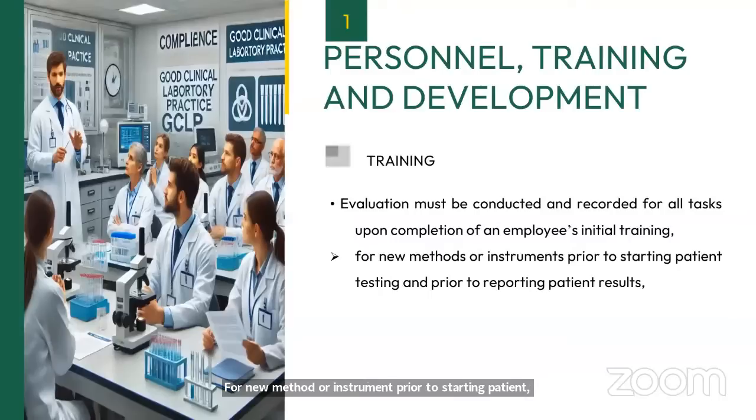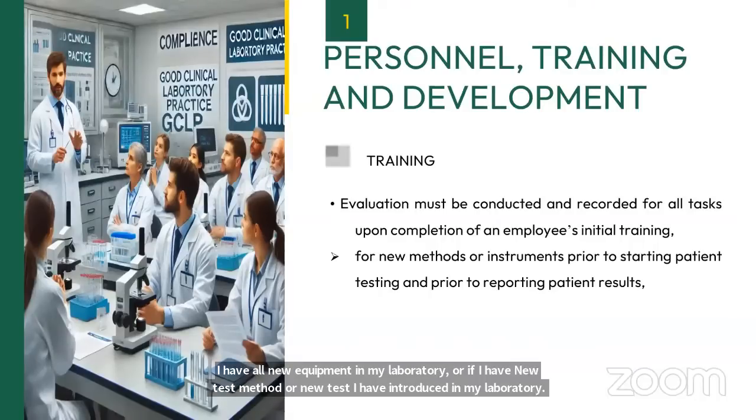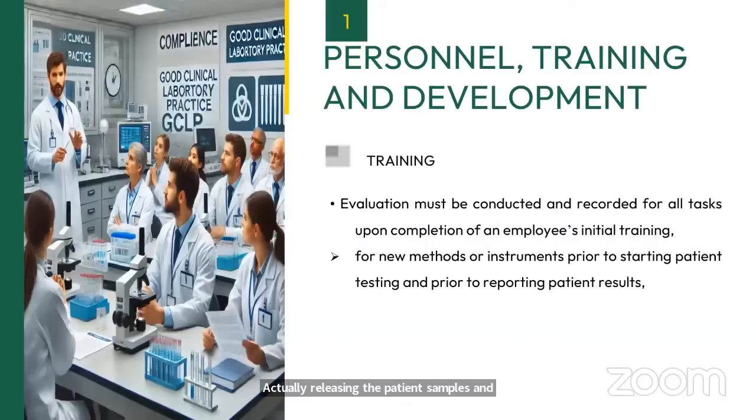Now, if I have new equipment in my laboratory, or if I have introduced a new test method or new test in my laboratory, then before I start actually releasing the patient results, I should train my staff. I should conduct their evaluations, whether they are able to perform this test appropriately. So a training should be conducted and evaluation must be conducted before starting any new test or any new equipment use.